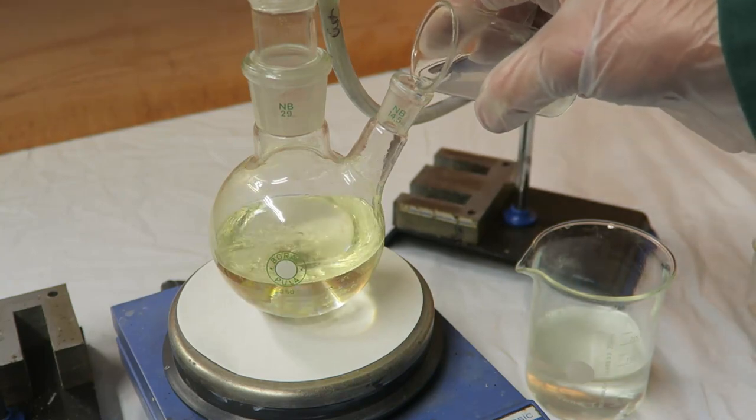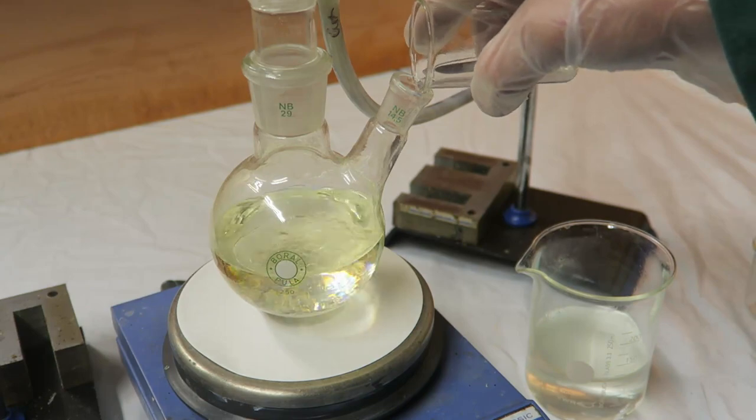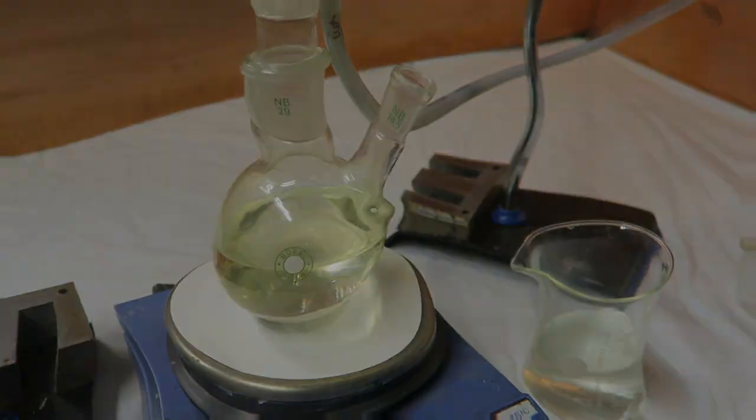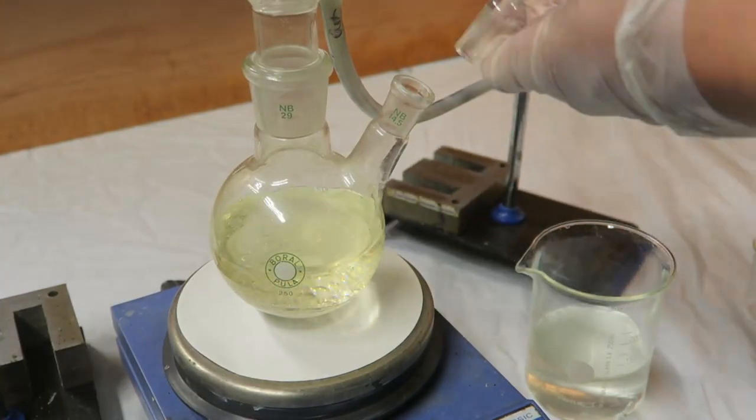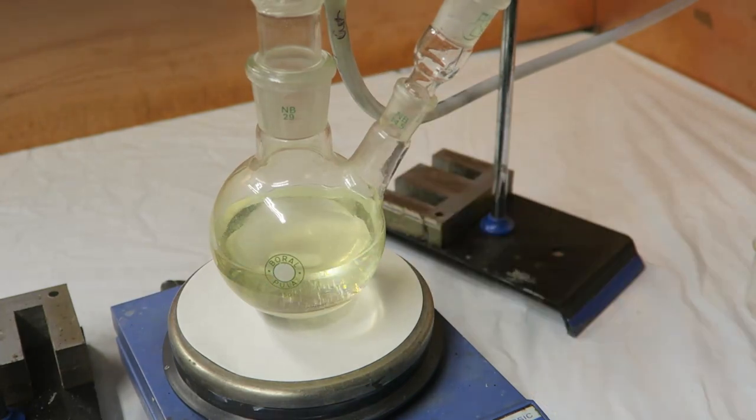Next, 0.1 mole of potassium hydroxide are dissolved in a minimum amount of water and is added to the flask. Also, I've added a stirrer.